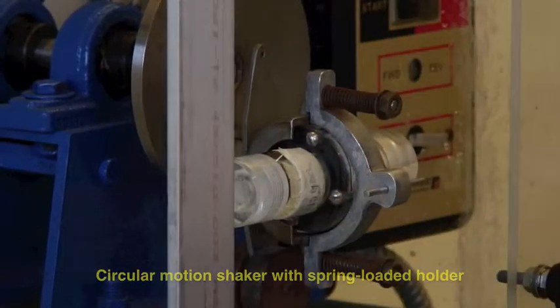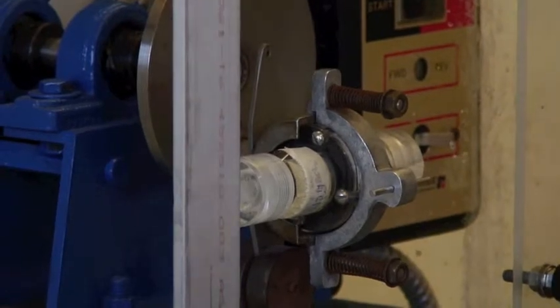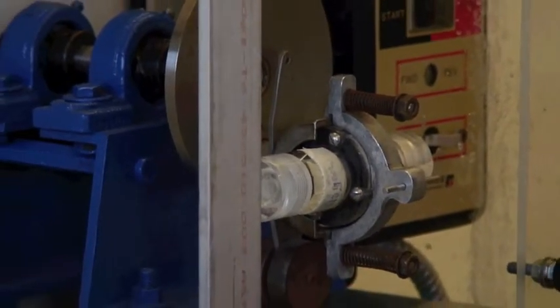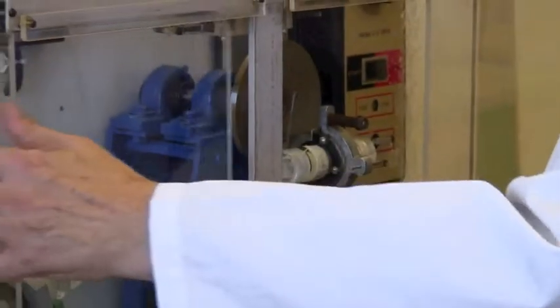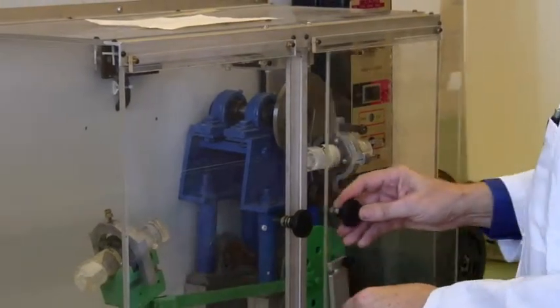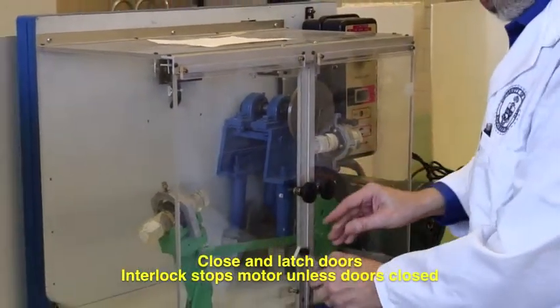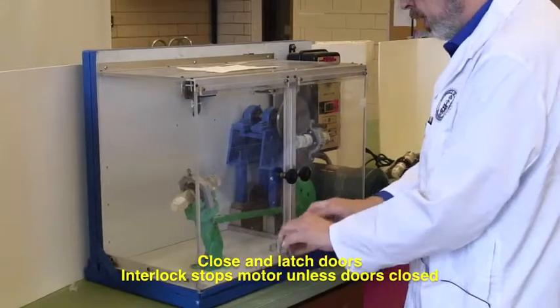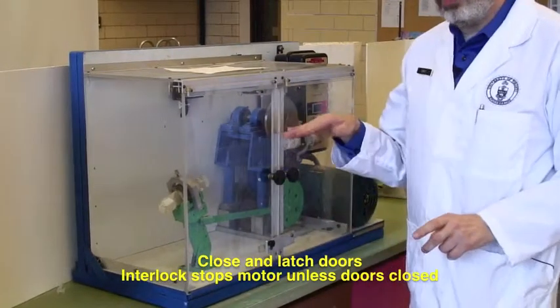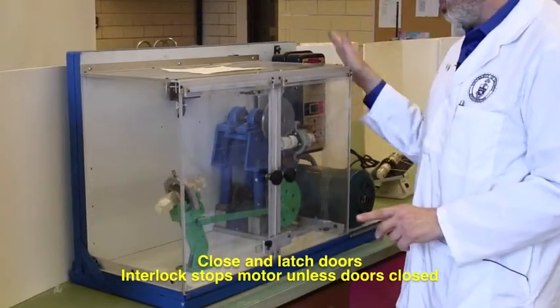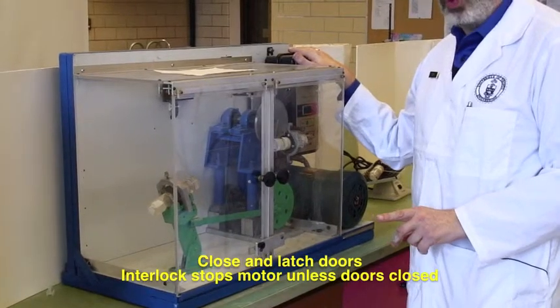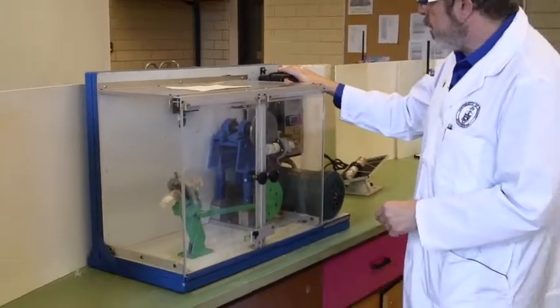Now, because this is a moving item, we need to protect us from it rather than pinch hazards. So the lucite doors close, and there's an interlock there. And until the doors are closed, the agitator will not work.